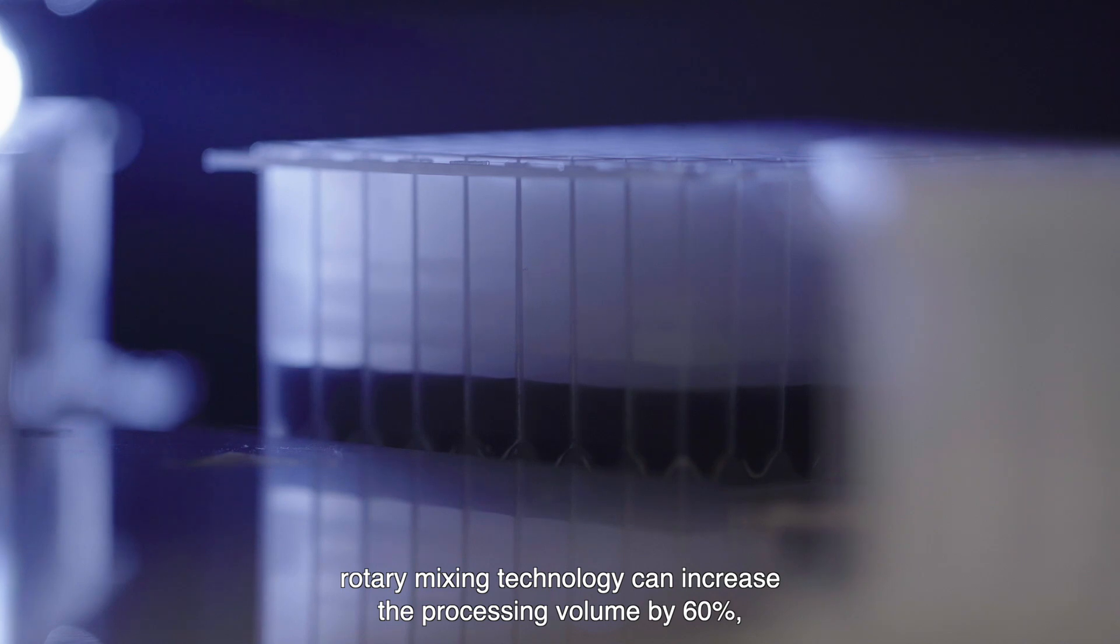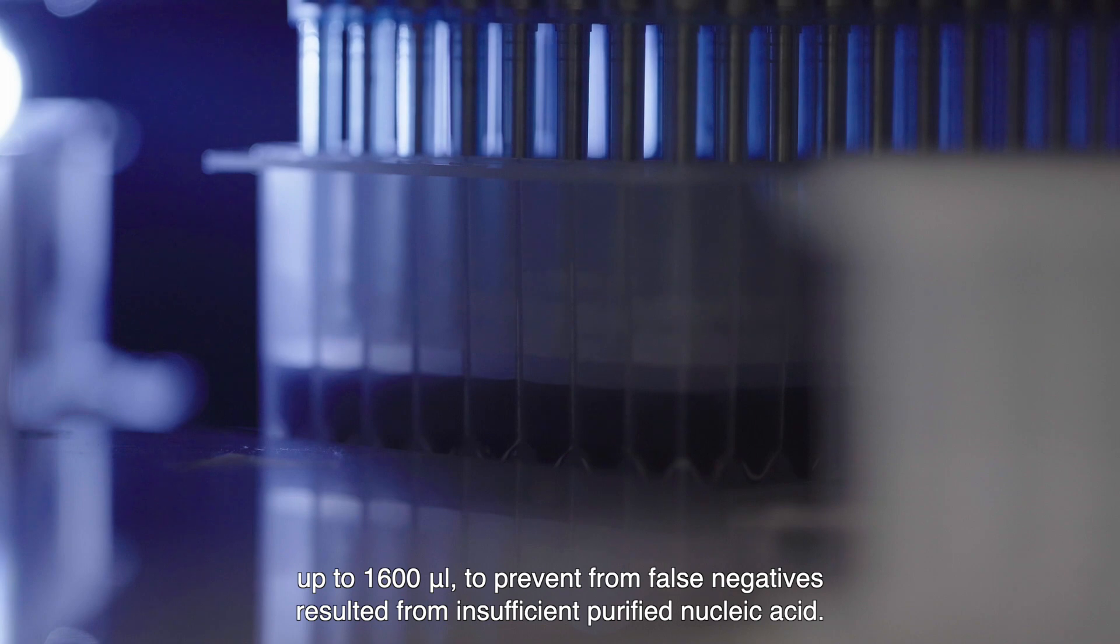First, it allows for more processing volume compared with conventional up and down binding techniques. Rotary mixing technology can increase the processing volume by 60% up to 1600 microliters to prevent false negatives resulted from insufficient purified nucleic acid.